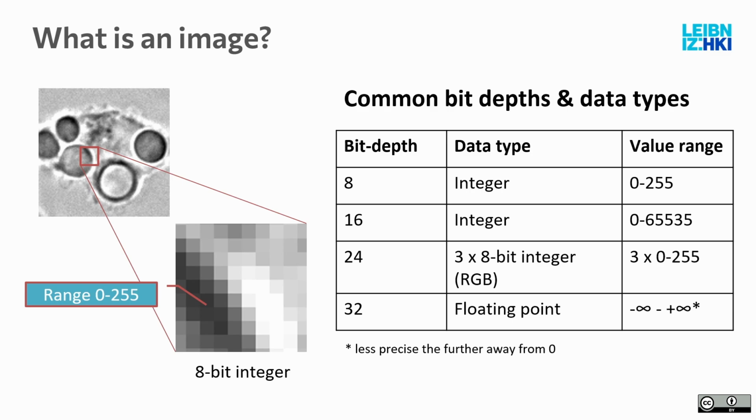There are also some special intermediate ones, like in between 8 and 16, there you will find 12-bit integer, but ImageJ doesn't really handle them and auto-converts them to 16-bit. Although you see them in their calibration tool as like a setting.